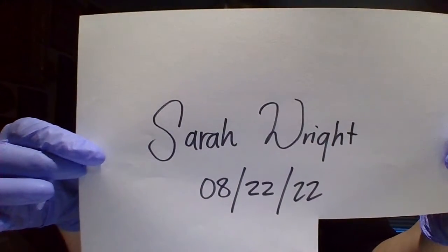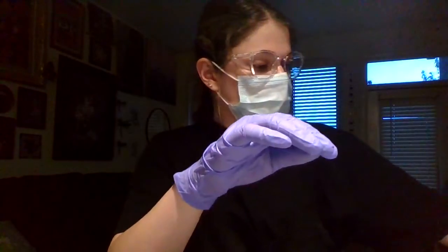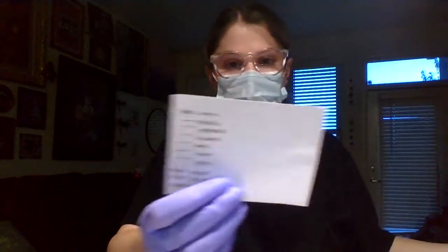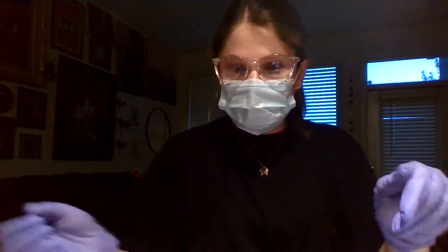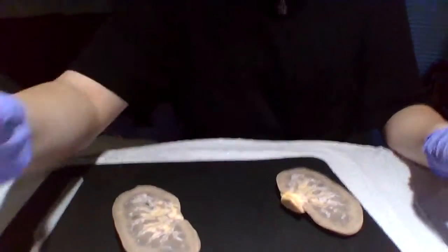Today is August 22nd, 2022, and here is my flashcard. There is nothing on the back, and today I'm going to be talking about my sheep kidney dissection. So I'm going to point the camera down here.